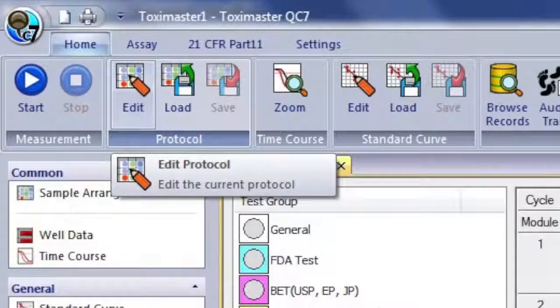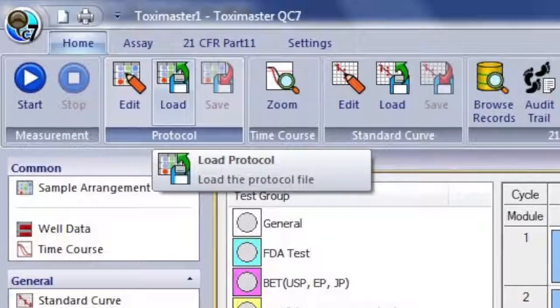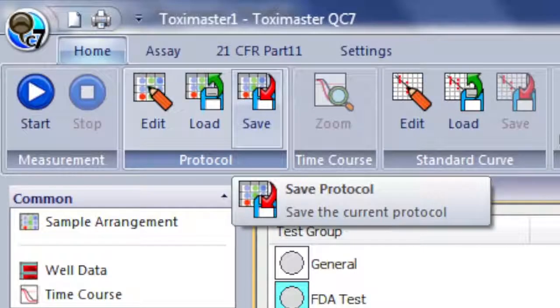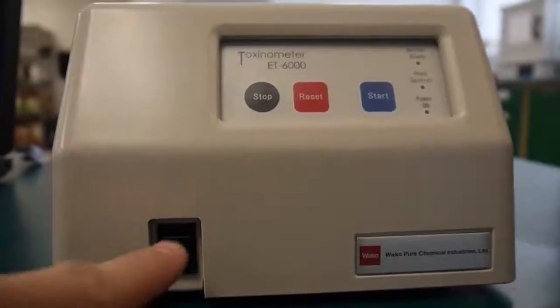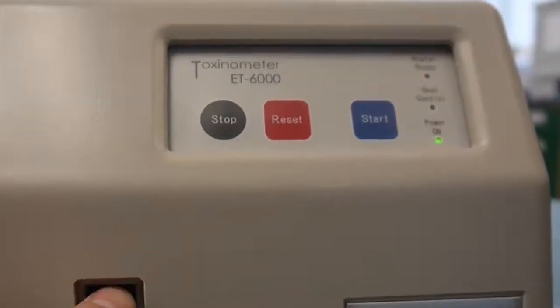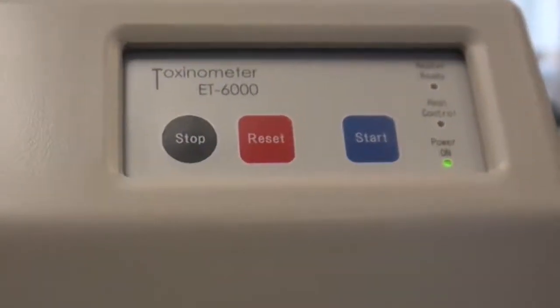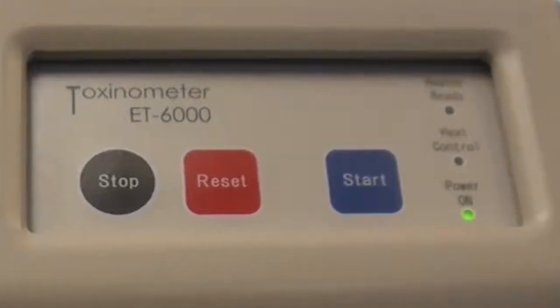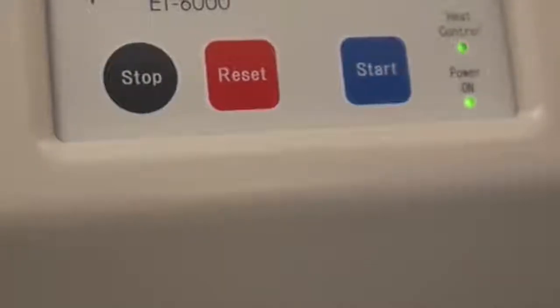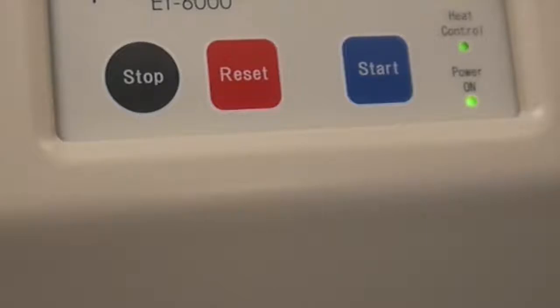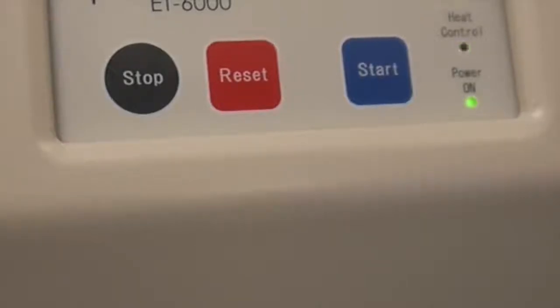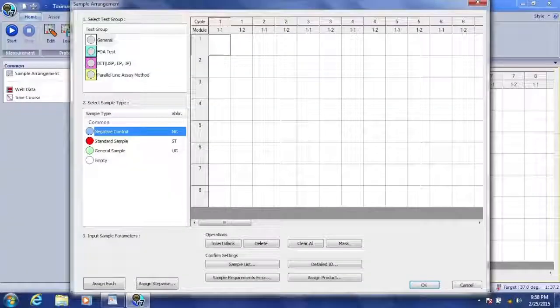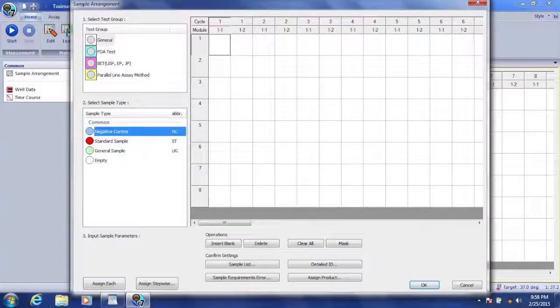The options to edit, load, or save a protocol is found on the toolbar as well. We should now turn on our Toxinometer as we arrange and prepare the samples for testing. You will notice the Heat Control LED blinking as the Toxinometer reaches the correct temperature. Now that we're ready to begin, let's arrange our sample.